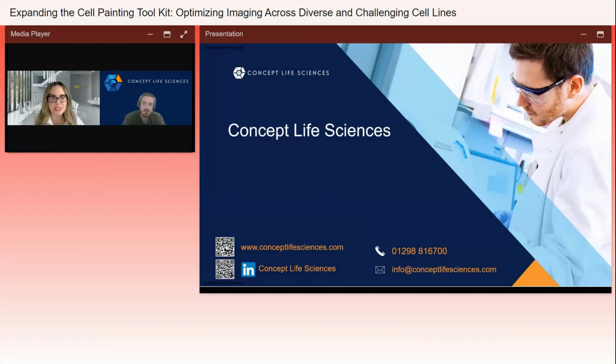Perfect. It looks like we have time for a few more questions here. So this next one says, cell painting analysis is really complex and sometimes subjective to interpret. Do you have a fair criteria to determine if the analysis is good enough to resolve the different experimental conditions? So again, it is going to be subjective. Although all of this is performed on different cell lines using the same set of compounds, using the same masking parameters that are captured during the same experiment, ultimately you will be the one that is setting the thresholds for those parameters.